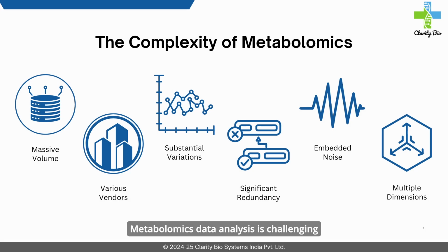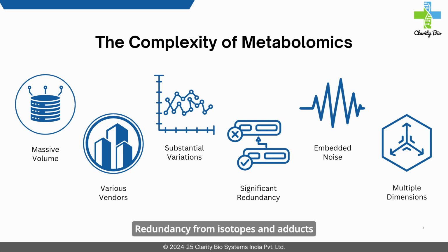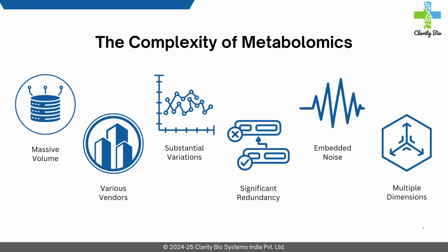Metabolomics data analysis is challenging due to high data volume, vendor-specific formats, and variability in instrument response. Redundancy from isotopes and adducts, combined with noise and high dimensionality, further complicates interpretation.